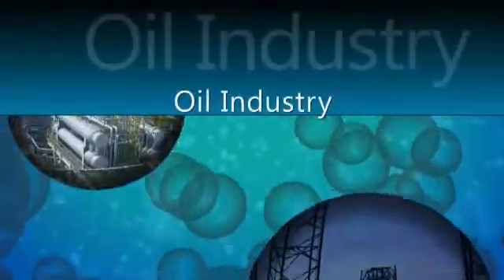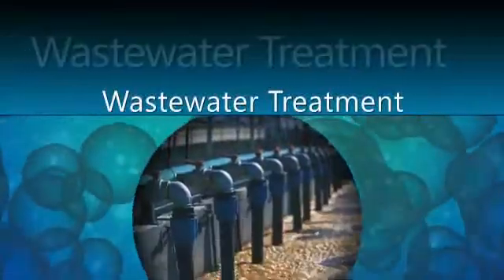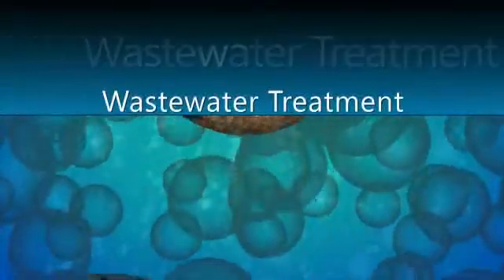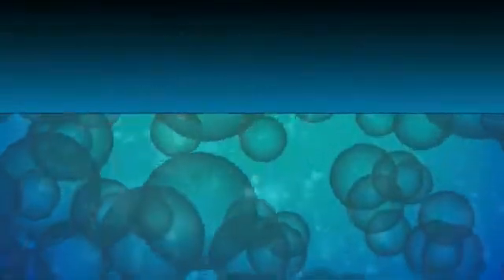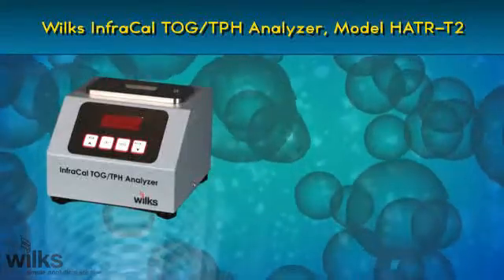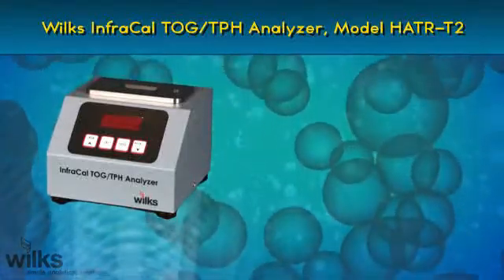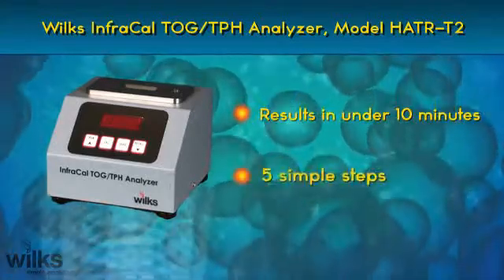Whether you work in the oil industry, offshore or onshore, are a wastewater treatment professional or employed by a company that must regulate the amount of oil or grease in its effluent discharge, the Wilkes InfraCal TOG TPH Analyzer, model HATR-T2, will give you the measurement results you need in under 10 minutes with just five simple steps.